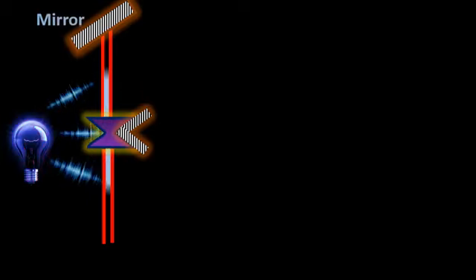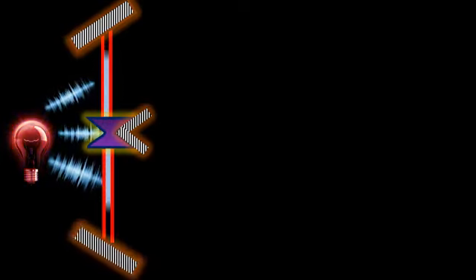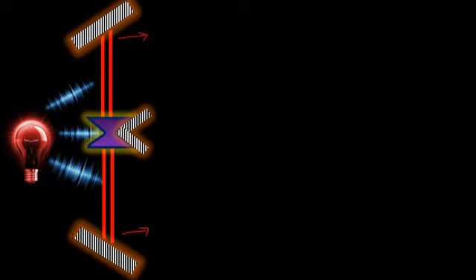Before reaching the monochromator, the infrared radiation from the optical chopper will pass through two reflective mirrors like this. The reflective mirrors will reflect the IR radiation toward the monochromator.